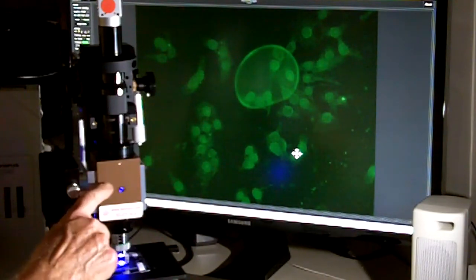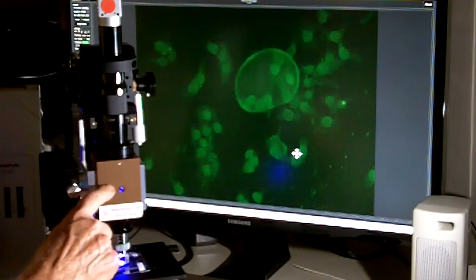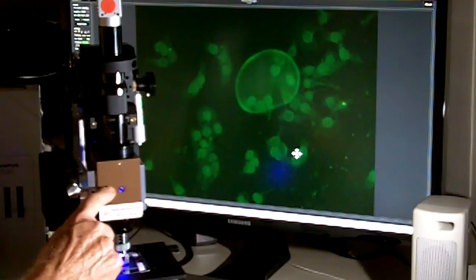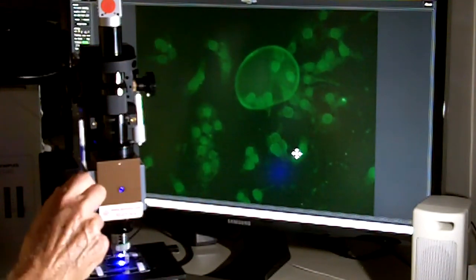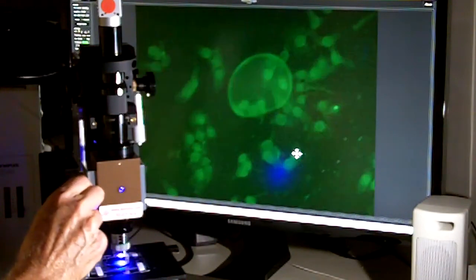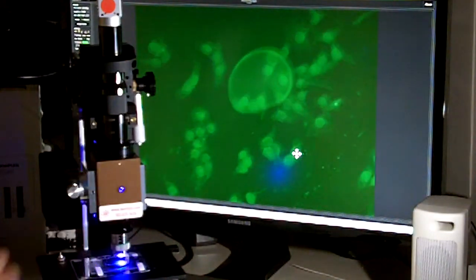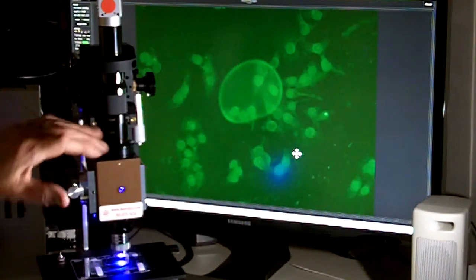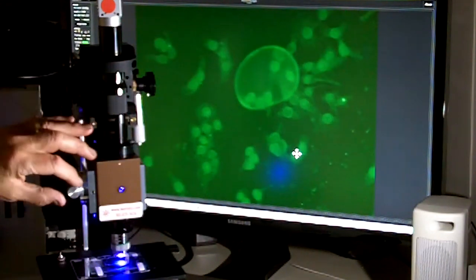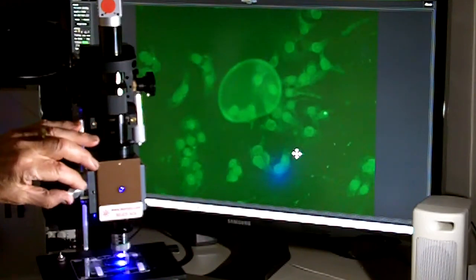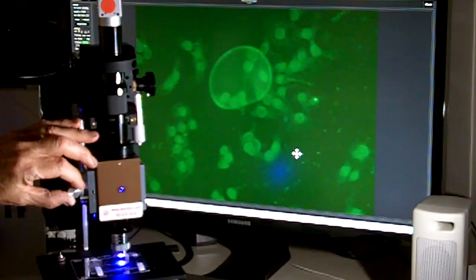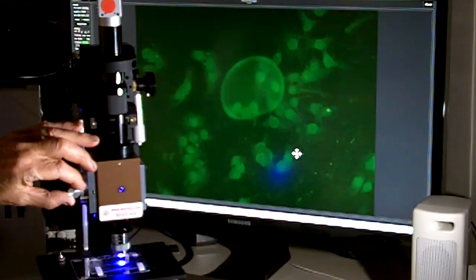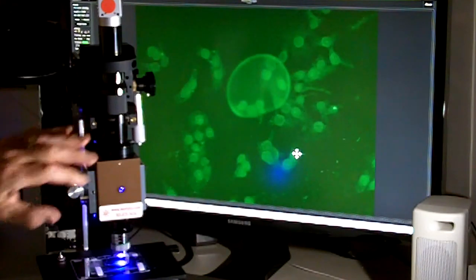The filter cube that's in here is optimized for a GFP preparation. But for demo purposes, I think you'll get the point. With the LED, blue LED coming through the filter cube, we can even adjust the intensity from the LED itself.